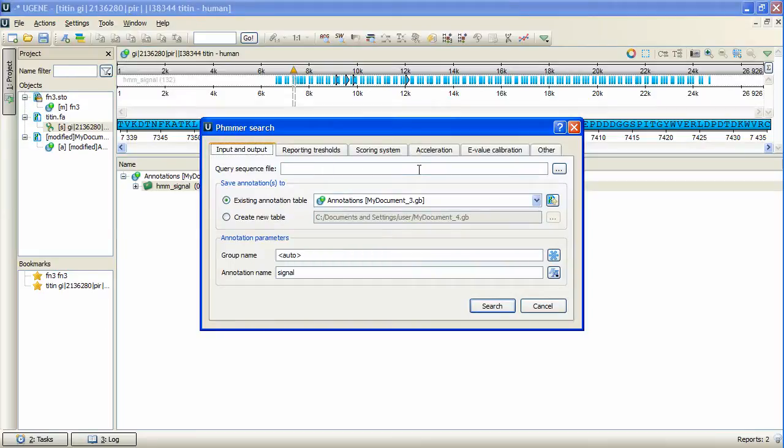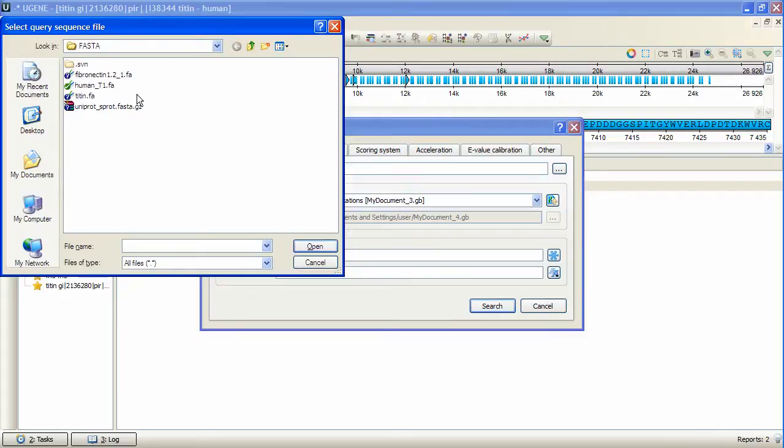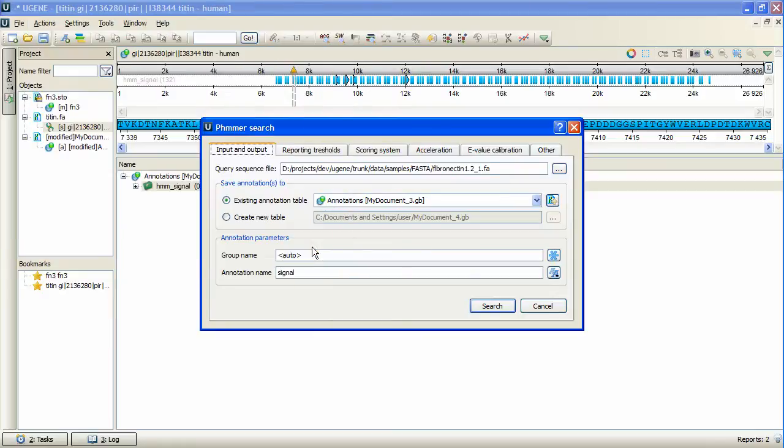In the first tab of the opened dialog box, we specify the query sequence file. We will search for homologs of this sequence within the opened sequence. To do so, HMMER will automatically create a special profile for the specified sequence and then use it for the search.